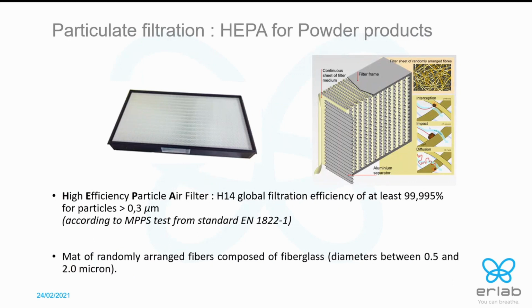How it works, basically, it's a network of fiberglass that is arranged randomly and that will physically prevent the particles, the dust, but also bacteria or even viruses, from going through the filter. They will be physically blocked by the filter. This technology has been around for a long time.